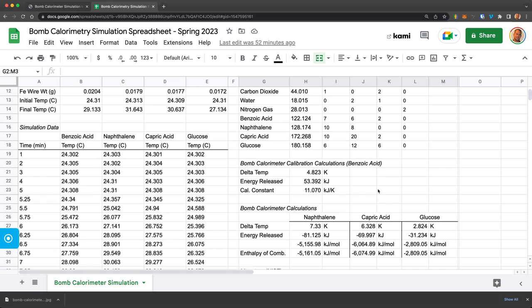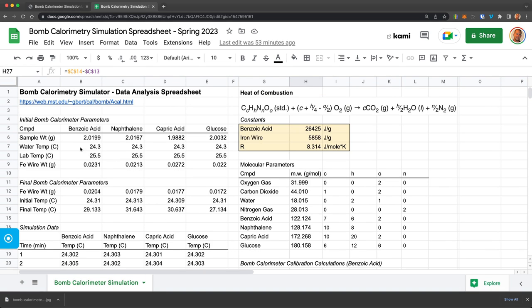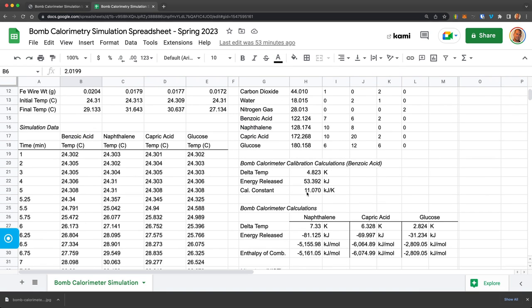And then to be precise here, I went ahead and calculated the change in temperature. So I used benzoic acid to give me, to calculate the calorimeter constant.